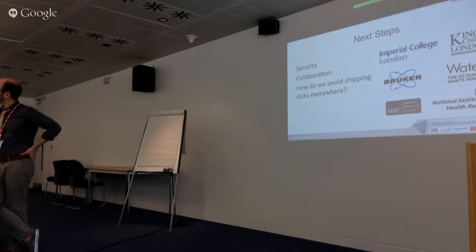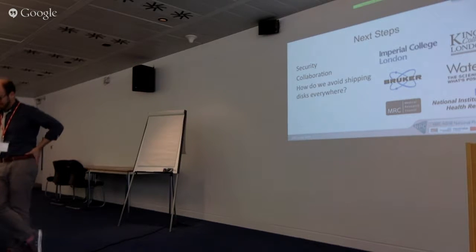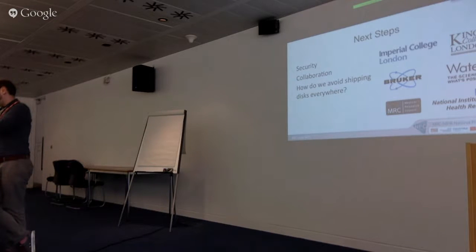It's probably silly for me to ask you this question since your office is like three doors from us. But I just wondered if you had tried any standard compression algorithms on either the continuum or centroid data, and how much compression factor you can get out of it. So zipping up the continuum data, you get maybe a 20% reduction.